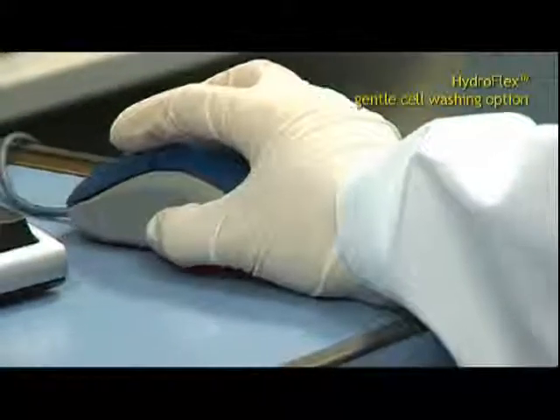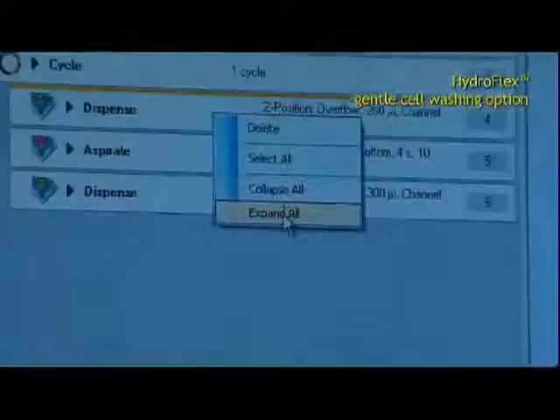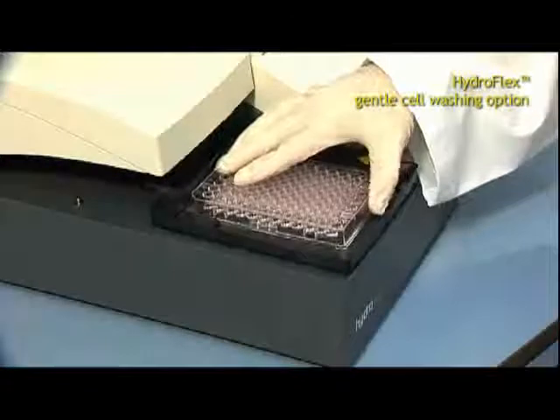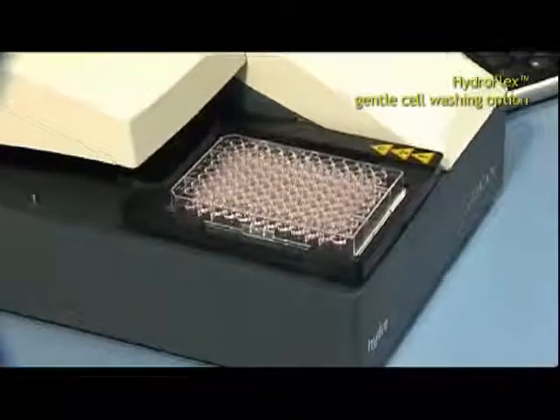Only three clicks of the mouse and an ELISA wash protocol can be adapted to a cell wash program. No hardware change is necessary — the same manifold can be used for either ELISA or cell washing.